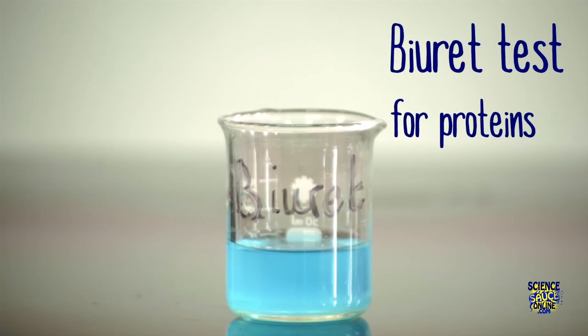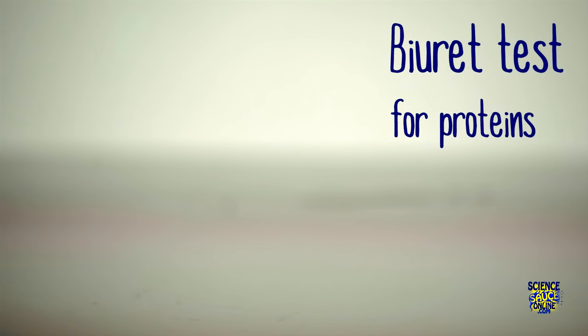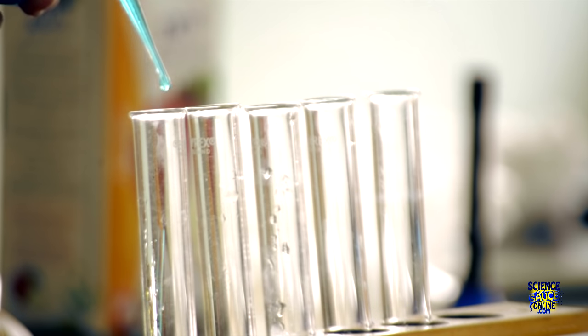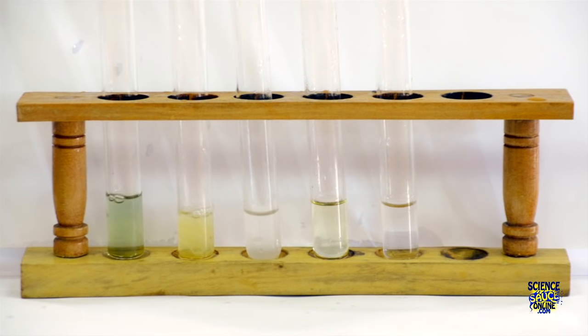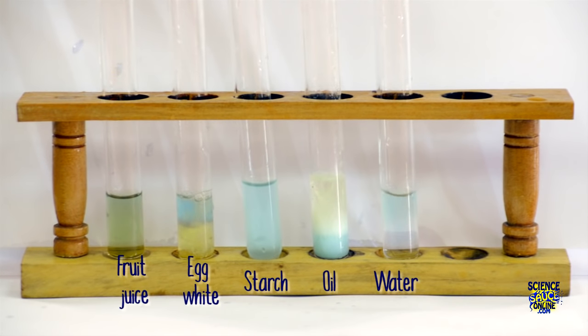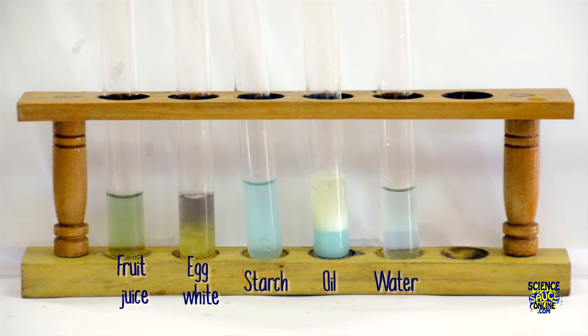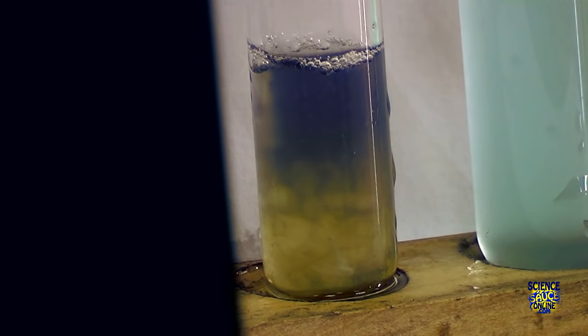Next let's look at the biuret test for the presence of proteins. Take your biuret solution and add it dropwise to each of the samples. If we give it some time for the reaction to take place we can see in the egg white it turns a sort of purplish violet color and that suggests that protein is present.